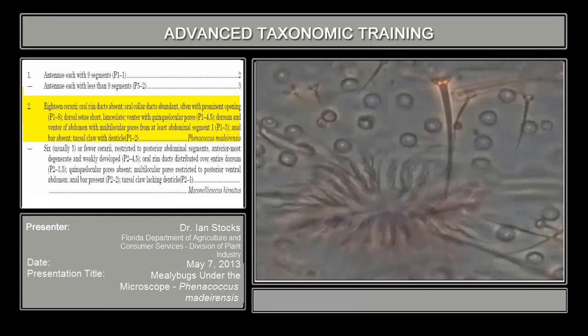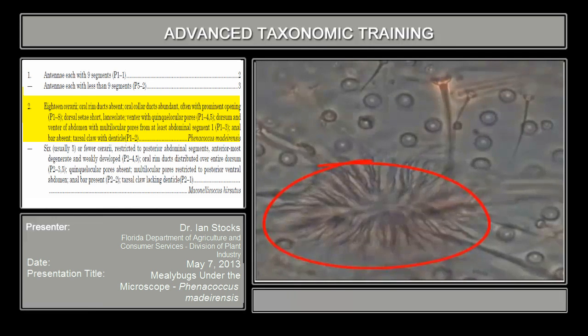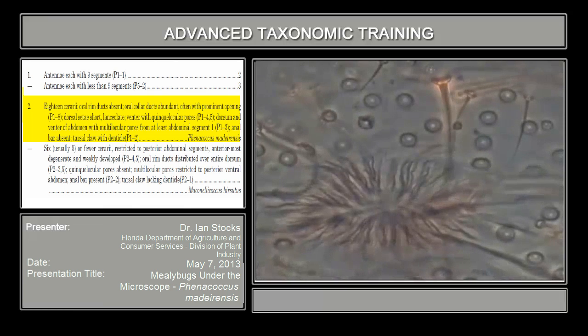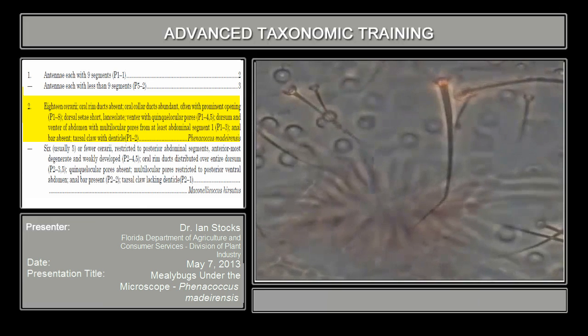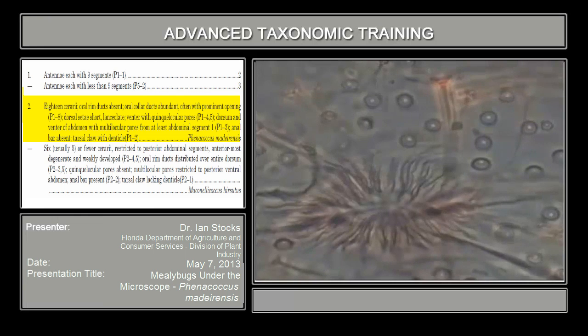And it's also a good idea to try to validate that you have an adult specimen for the purposes of the key. This structure here is the vulva, and you can tell that it's the vulva. It's got a very distinct modification of the cuticle. It's going to be very pleated-like, almost like it has a drawstring that can pull it tight. Okay, it's restricted to the venter, just before the 8th segment. So it's also a good regional landmark that you're around the 8th segment.